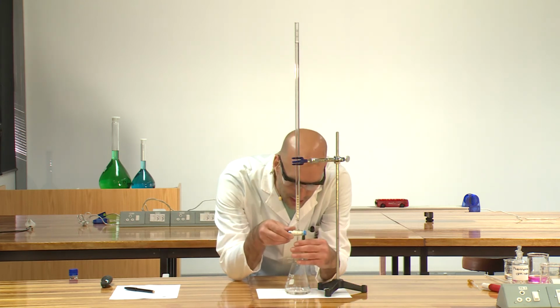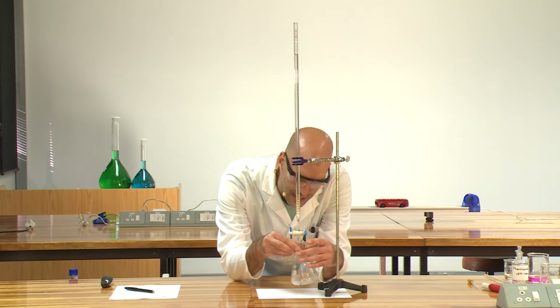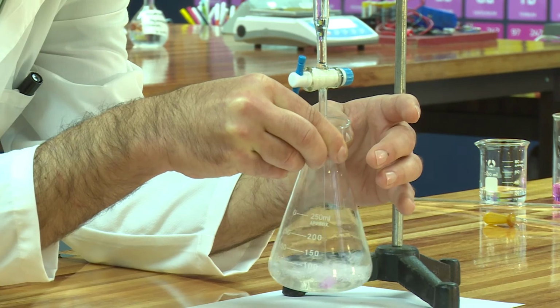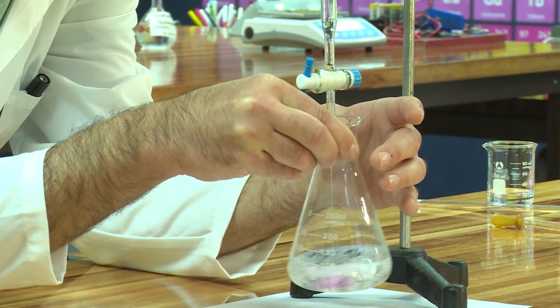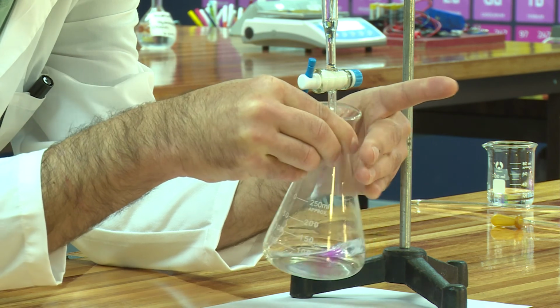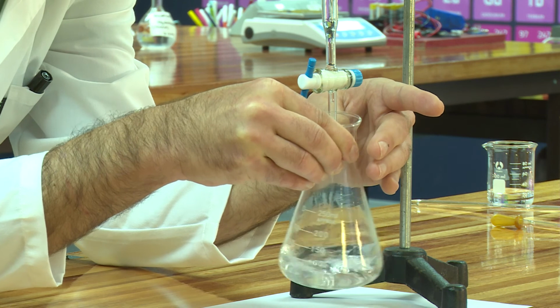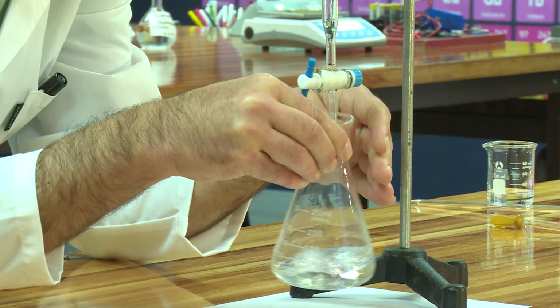So I'm just going to go down here. I'm going to open my tap and start running it down. As you do this, you can see where the sodium hydroxide is hitting the indicator. It's showing a slight pink color in there. Let's slow down slightly and not go too fast, because the pink is staying slightly longer around.